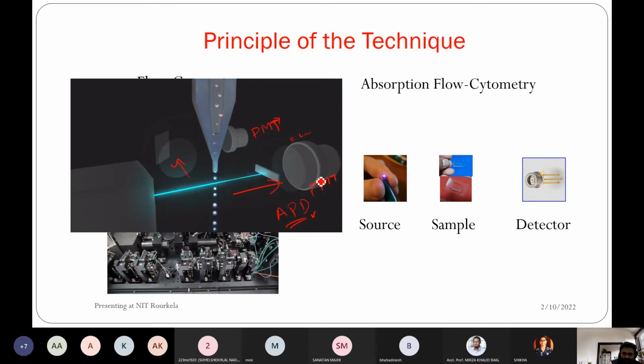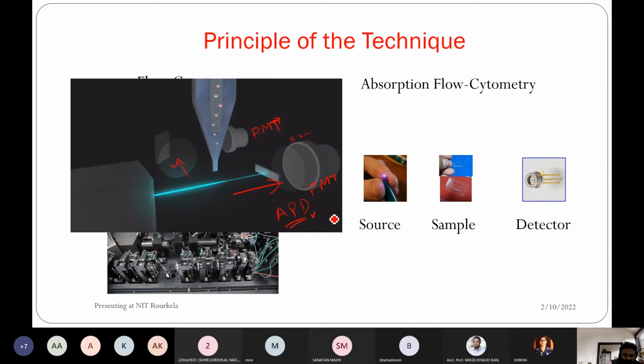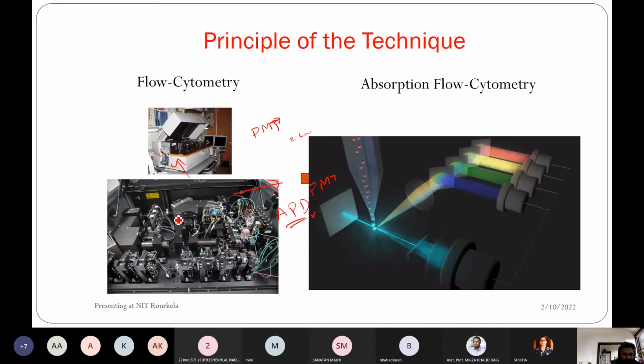care device. It was realized after completion of the work as absorption flow cytometry. And instead of the complex structure we have here, you can see this is the integration of optomechanics, optics, laser and electronic components, and various detectors, everything will be there. Okay, so that was the third.